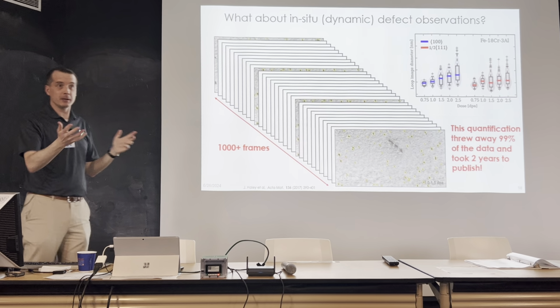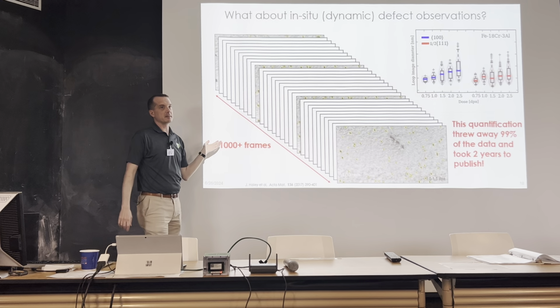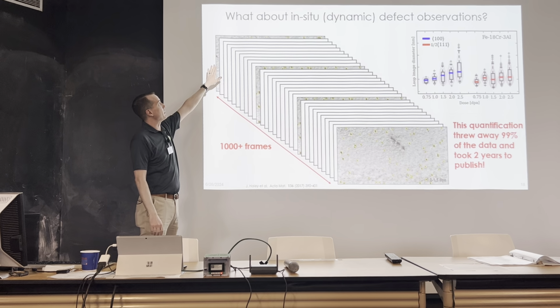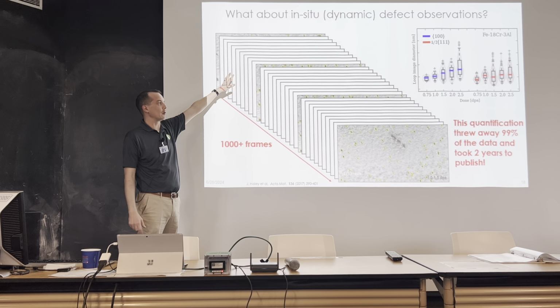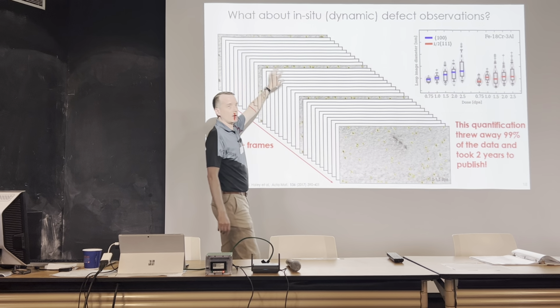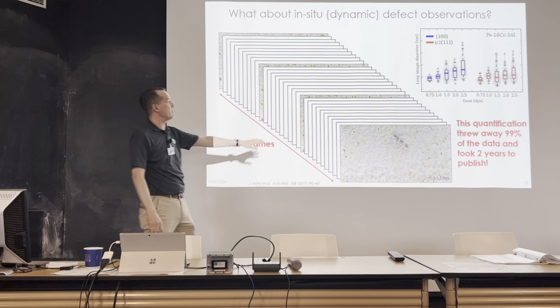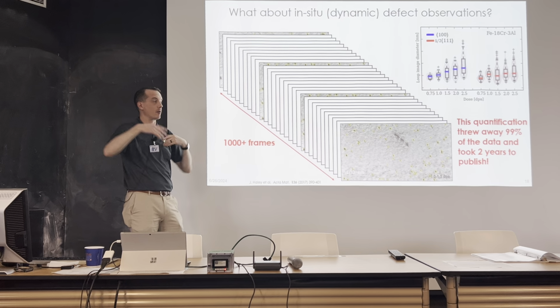All right, so what they do, because they don't know, is they will just collect thousands and thousands and thousands of frames, and then they sit there and they will have 1 cup of coffee and they get maybe a couple of frames done, and then they get bored and they leave, or they have an email, or they call, or they get tired, they fall asleep, whatever. So they end up only doing a couple of them over time, where they think that there's good things. So they might be missing those events that are occurring in between the frames if you're going faster.